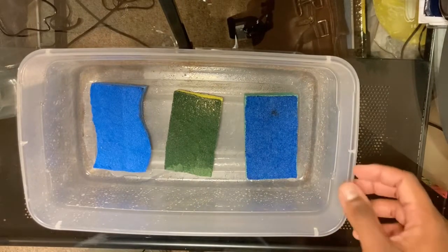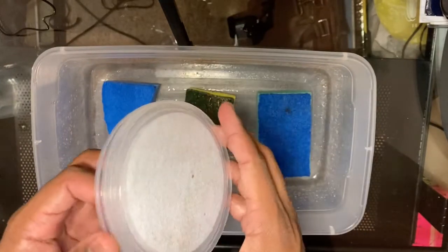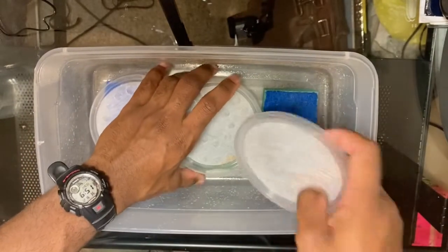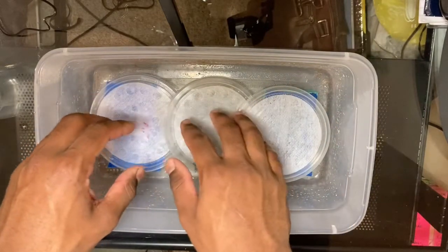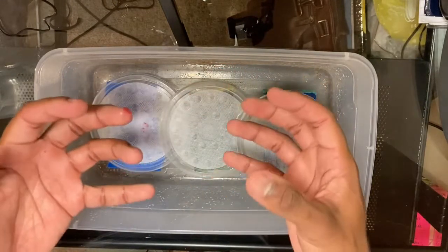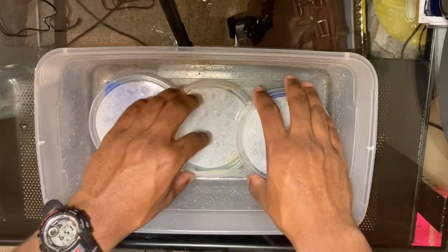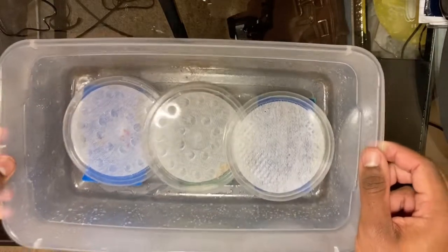The next thing you're going to need is really just kind of a preference — you just need something to lay on top of the sponges. I'm going to use these plastic lids and place them right on top, just like that. Your insect is actually going to be laying on top of these. You want to make sure the insect is not touching the sponges because they can actually grow mold if they get a little bit too wet. The whole point is just to give them enough moisture — not too much, but just enough that their bodies will be nice and loose.